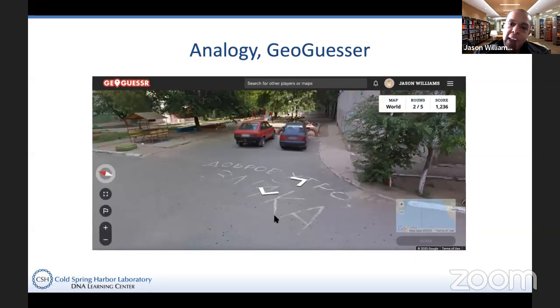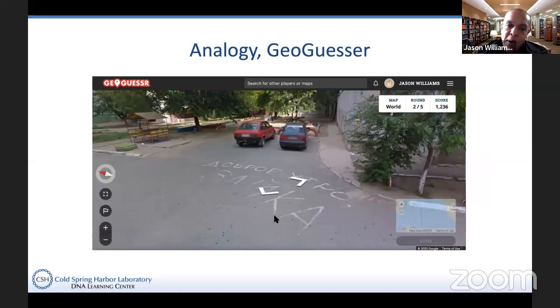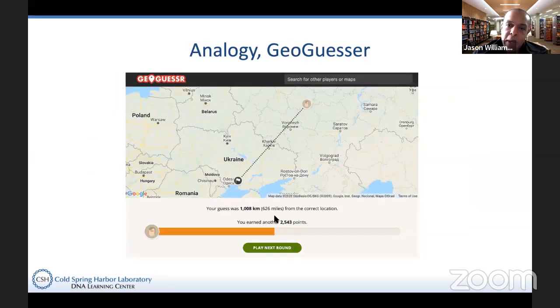My point in this analogy is that when we are using Kallisto as a computational tool, we don't need to look everywhere. We can infer a lot just from looking at a little bit of the data. And although I didn't include the slide here, this method, Kallisto, can take on the order of a few minutes, where previous methods took hours. So just by looking at the right part of the data, and just a little bit of it, we can advance what we're able to do.